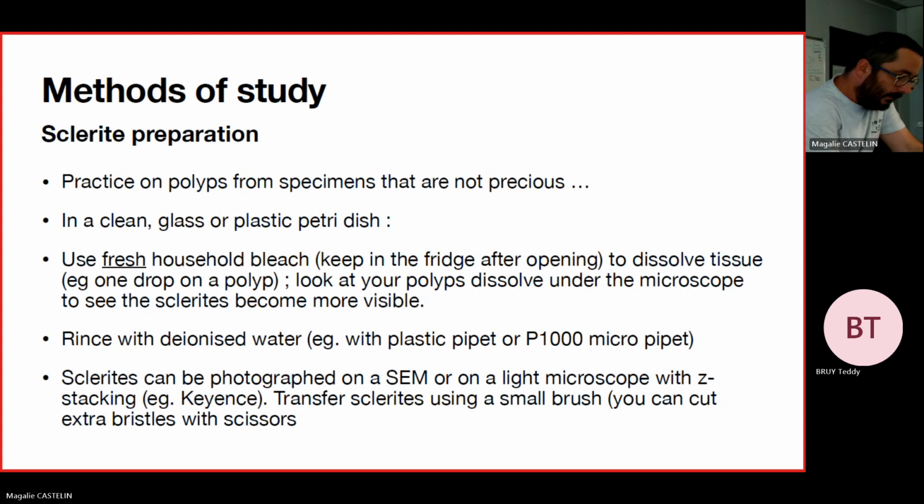So how do you get to that? I hope we have the time to actually test this today or tomorrow. It's not something that you try and succeed at right away, at least not me. It requires some practice, so my advice would be to find some polyps that are not precious and practice on those.